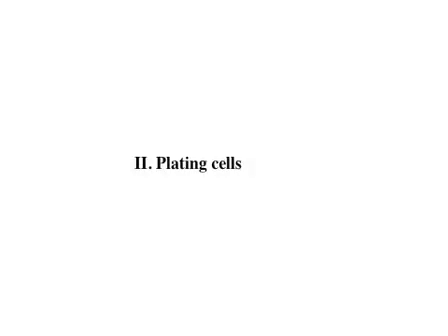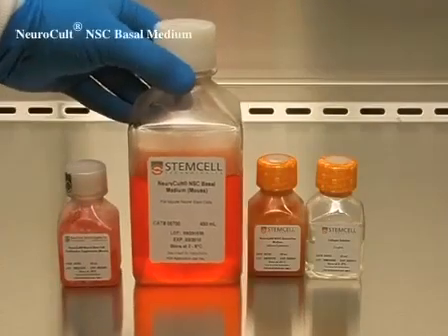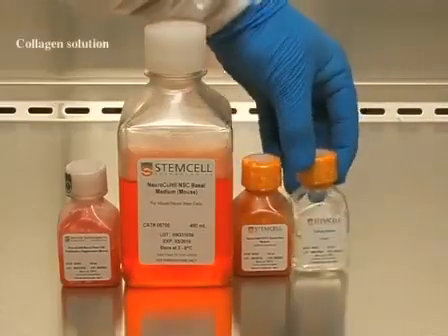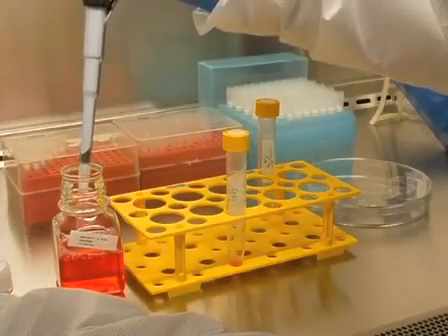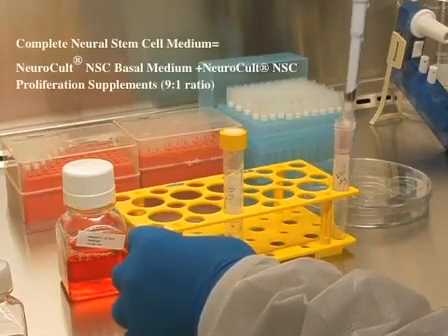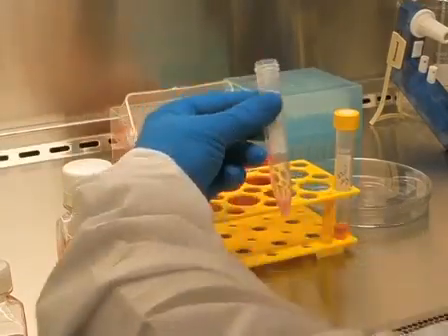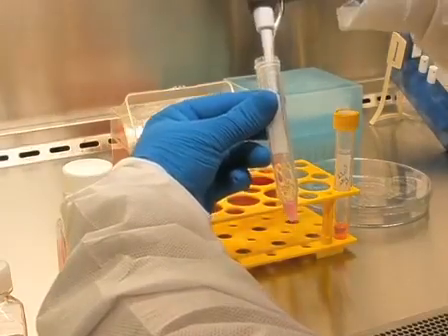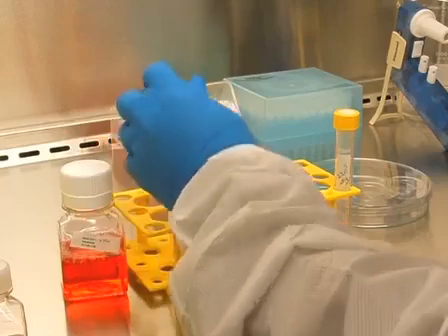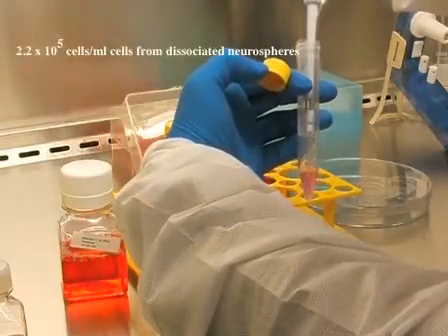For this assay we need NeuroCult neural stem cell proliferation supplement, basal medium, Neural-Colony Forming Cell Assay serum-free medium, and collagen. Pipette 1 ml of complete neural stem cell medium into a 15 ml Falcon tube. Take as much volume from the cell suspension you have already prepared and pass it through a 40 micron mesh filter in order to reach a concentration of 2.2 times 10 to the 5 cells per ml.